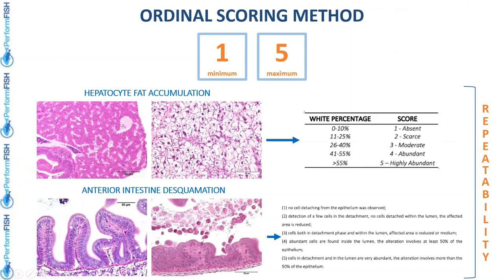This evaluation method is semi-quantitative, which means that a trained operator assigns a score to a phenomenon according to its magnitude.